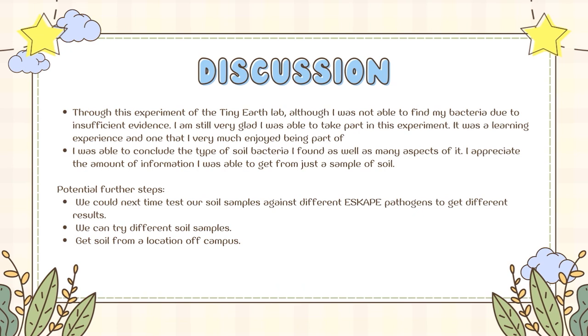I was able to conclude the type of soil bacteria I found, as well as many aspects of it. I appreciate the amount of information I was able to get from just a sample of soil. For potential further steps, we could test our soil samples against different ESKAPE pathogens in order to get different results.